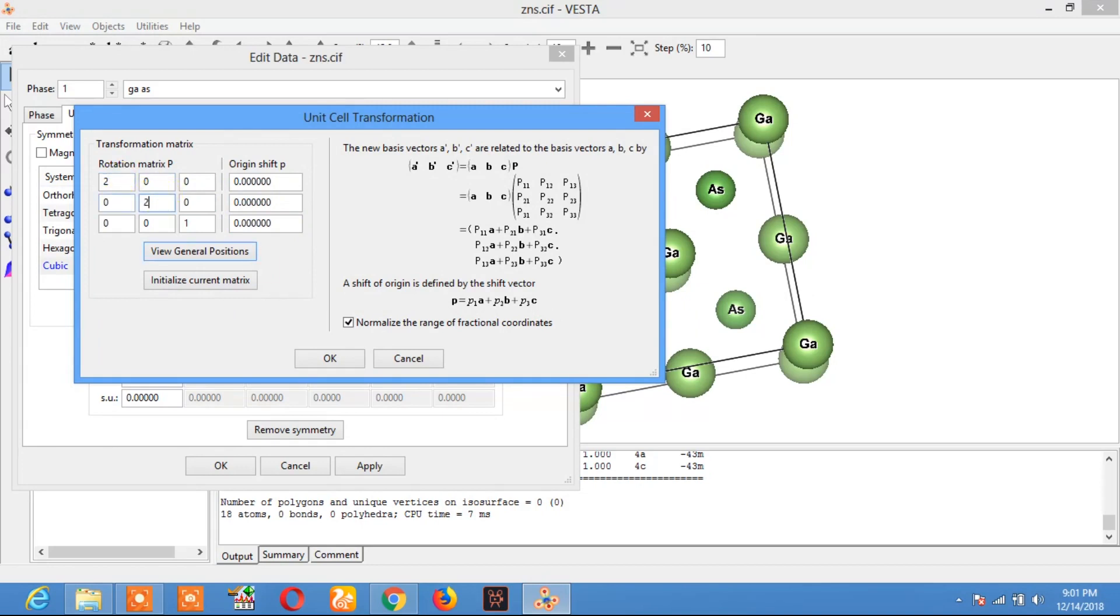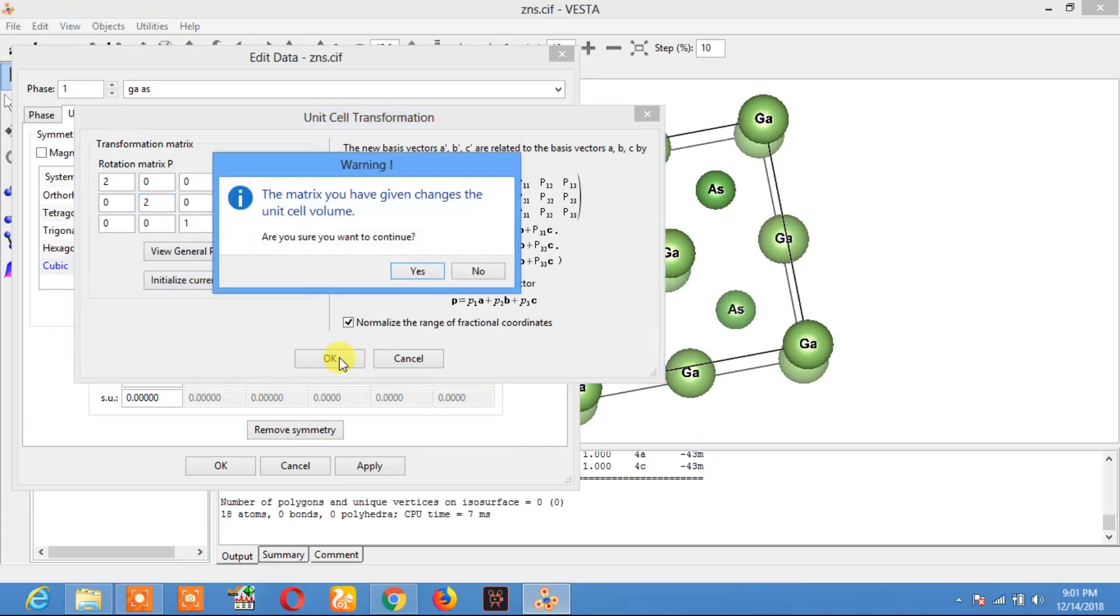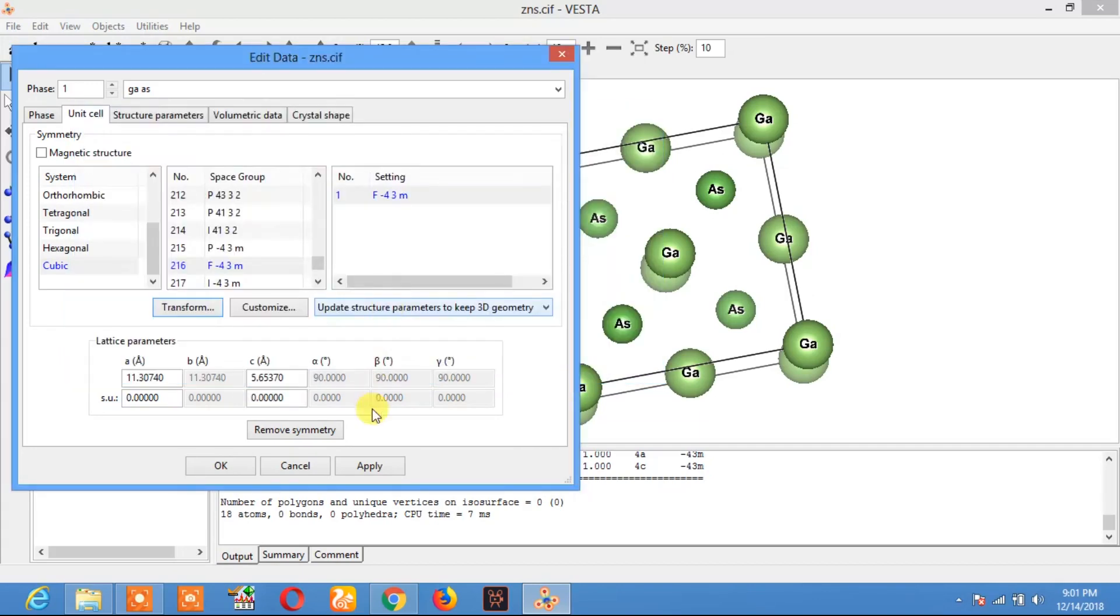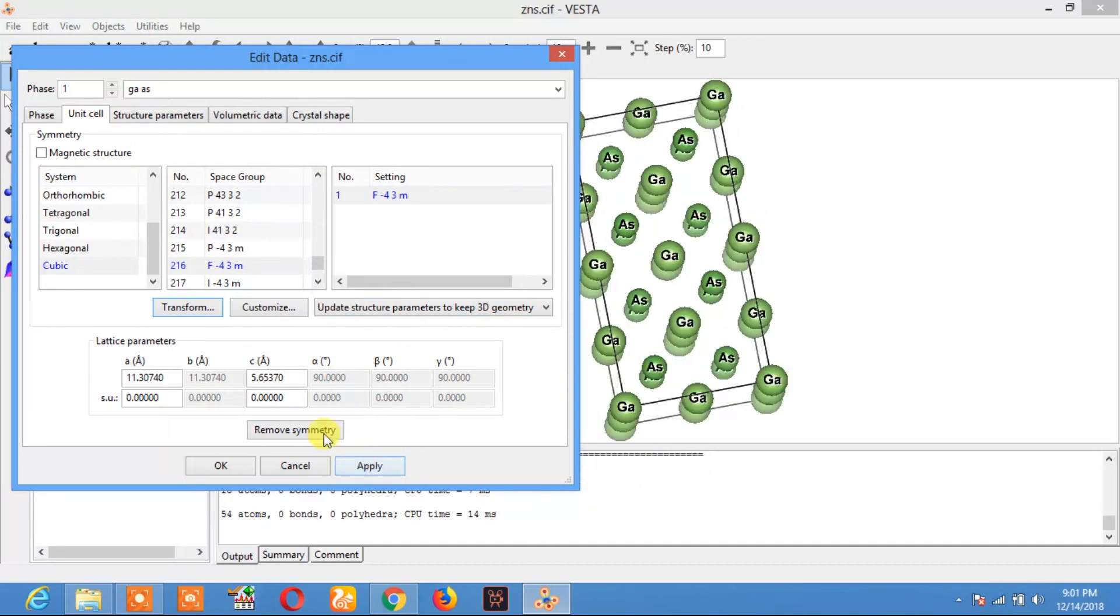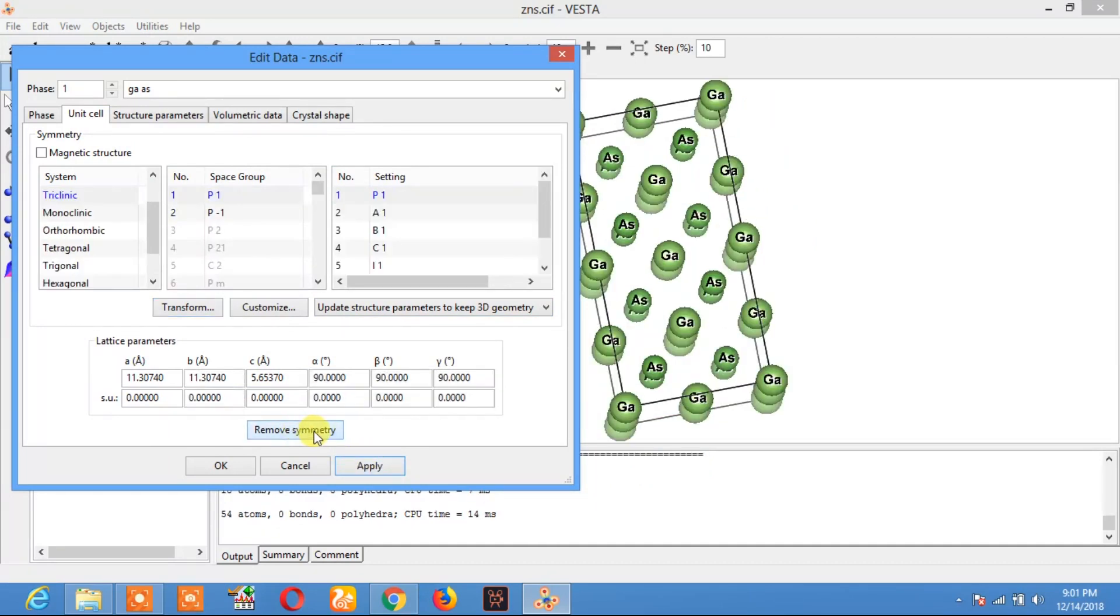Here I will remove the symmetry. Again, apply and click on OK.